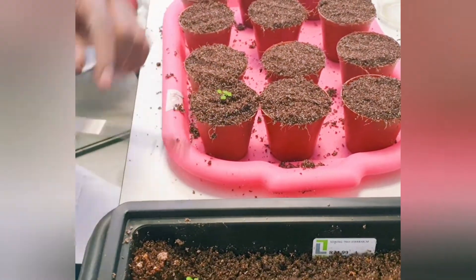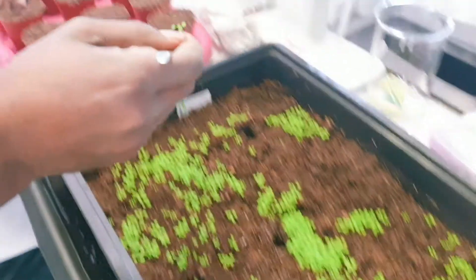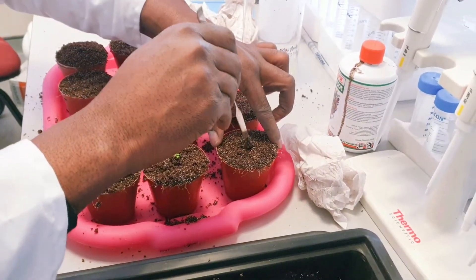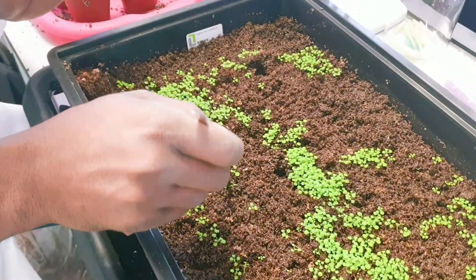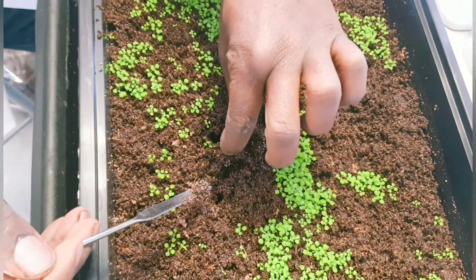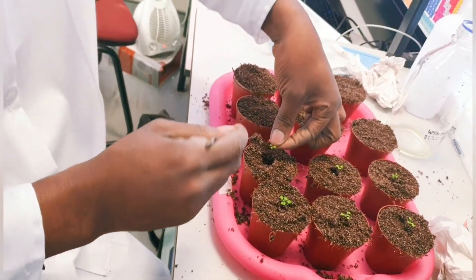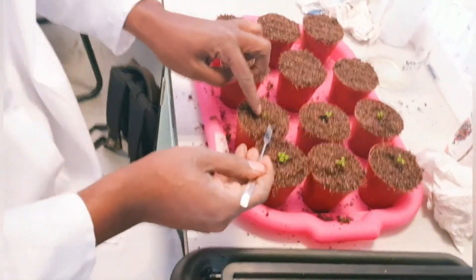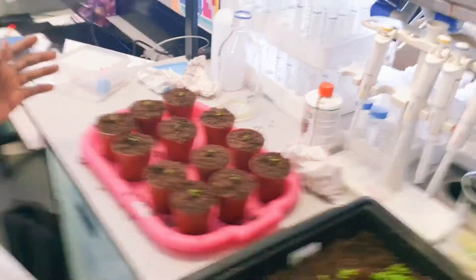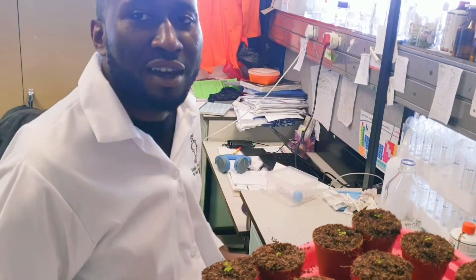I press it in — that's it. Then I dig another hole and look for bigger seedlings. This Arabidopsis is very sensitive; you have to handle it with care, like a baby. I grab the plant carefully — there are roots here, so make sure you don't cut the roots. Then you place it in the hole and close the soil around it.